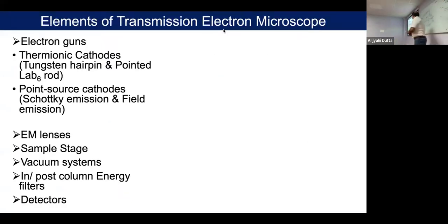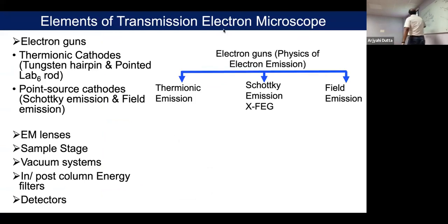Okay, so generally this electron gun, we have 3 different types. I'll talk a little bit about this one and then electromagnetic lens also. So here, if you look at this electron gun depends on that how much. So all the time, these electron guns are any metal, in that it will be a tungsten filament or modified tungsten filament.